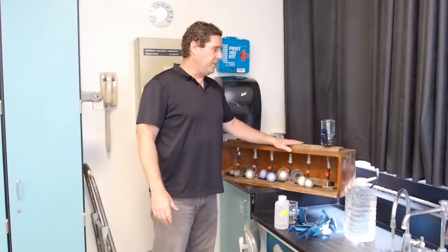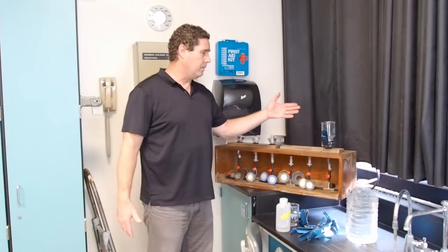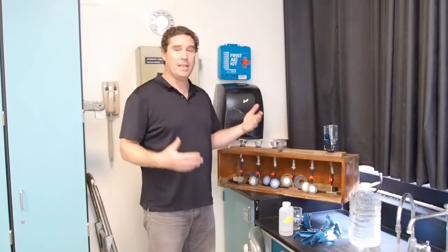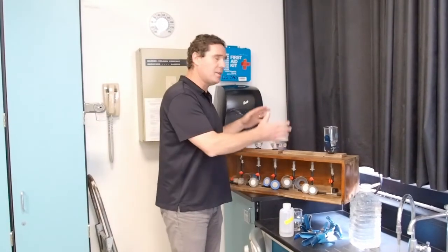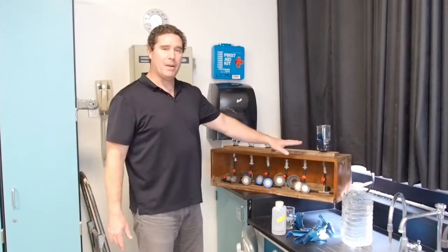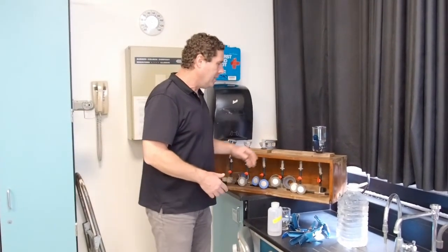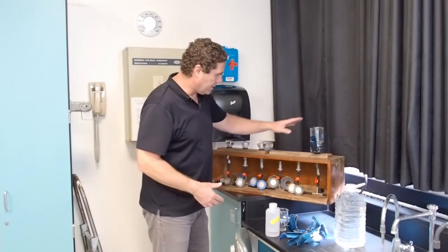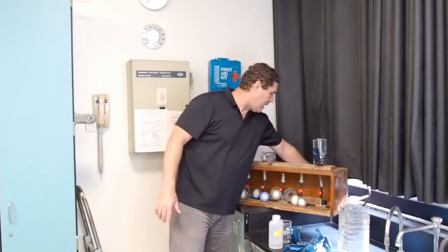Okay, so when we filter a sample, we need some suction. We need some vacuum. The water will eventually drip through this filter, but it'll take forever unless we actually motivate it somehow with some vacuum. So this is our suction or filtering apparatus. We have the ability to filter about 6 samples at a time. Today we're only going to do 1. And connected to this cup where we pour our water are these tubes, eventually connected to a vacuum supply over here. So I'm going to actually turn that on.